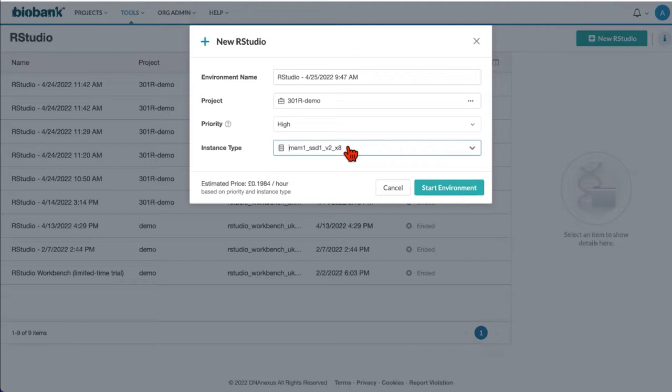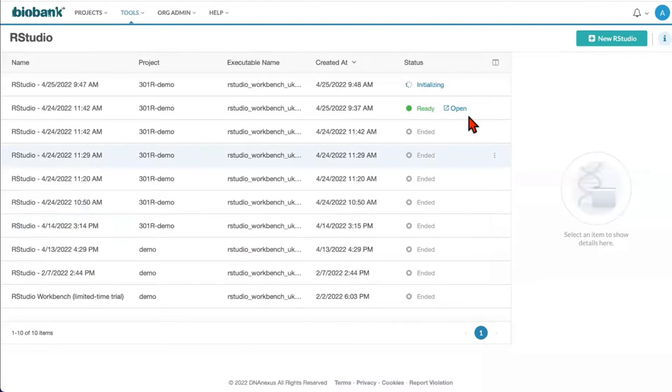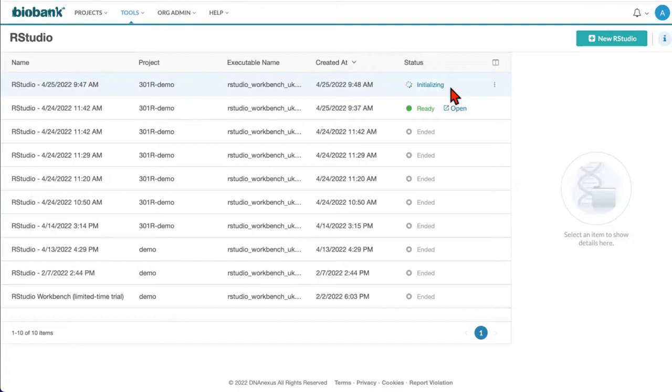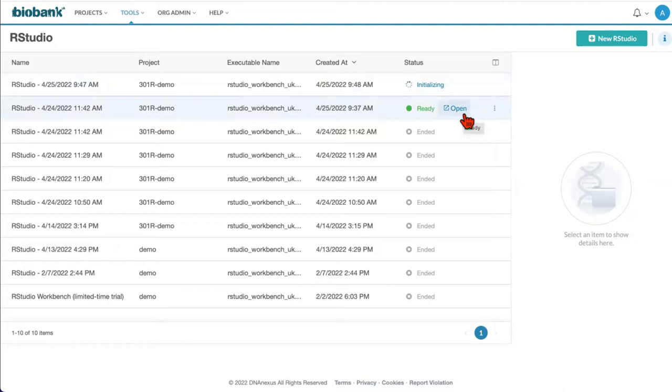You can then click on start environment and you see that now your job is in initializing status. Launching RStudio Workbench could take some time, a few moments. When it will be launched, you will see status as ready and the link will appear that will open RStudio session dialogue in the new tab.